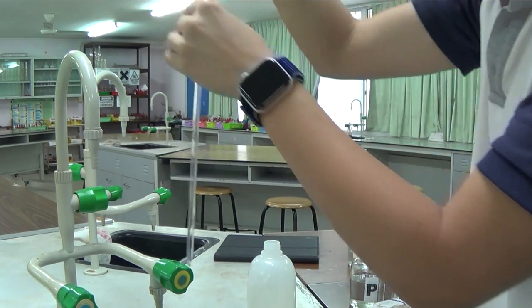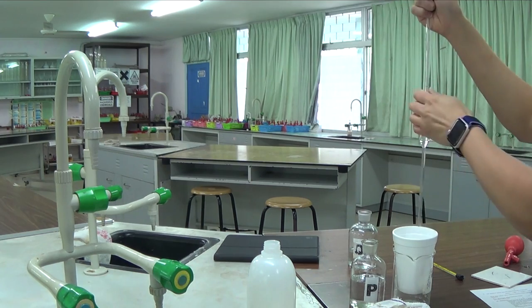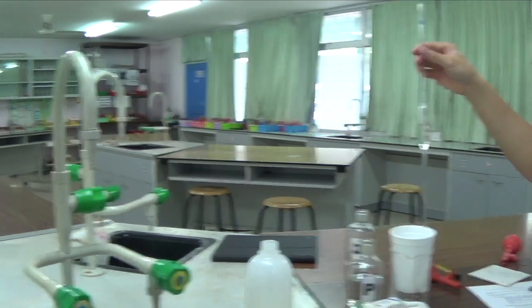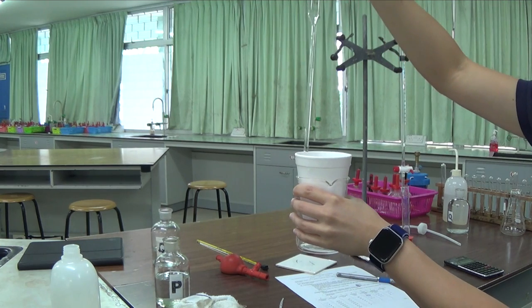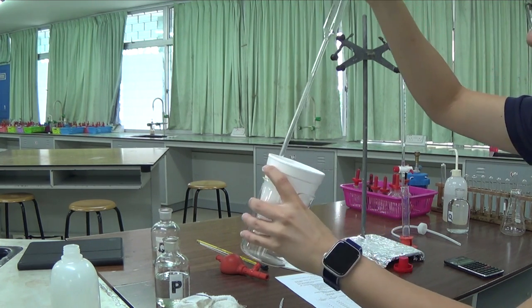And it's 25.0 cm cubed now. Inject it into the plastic cup. Okay, take out by rotating very, very gently the pipette filler, and gravity will do its job for you. That's when the solution will come down from the pipette into the plastic cup, well, styrofoam cup.